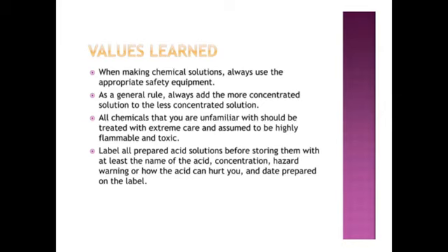Take note of that. For instance, that of acid, you add concentrated acid to water, not the other way around, not water to acid.